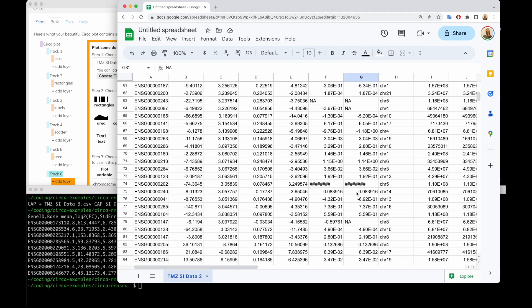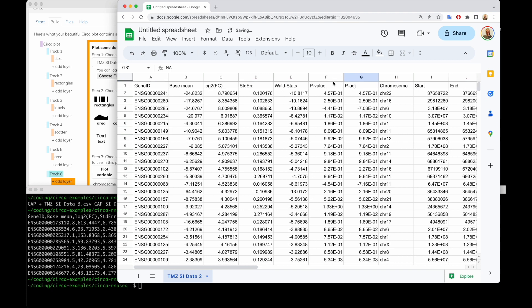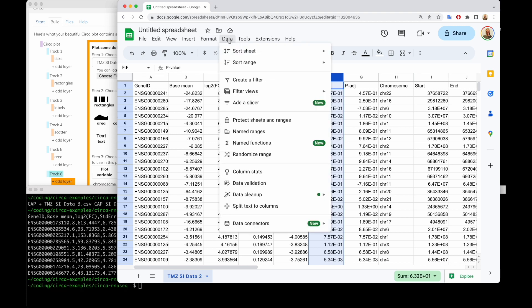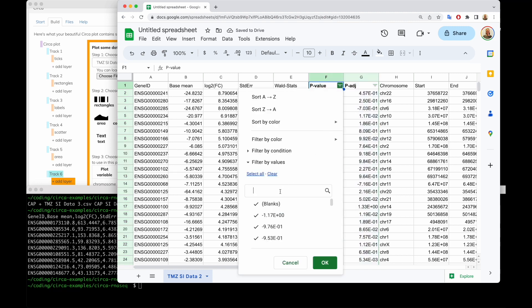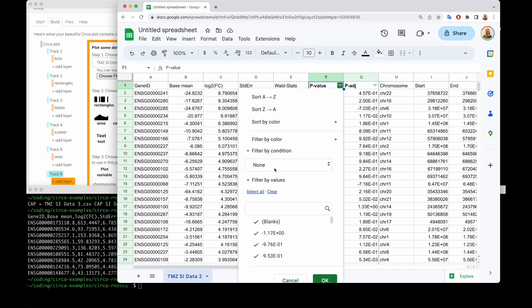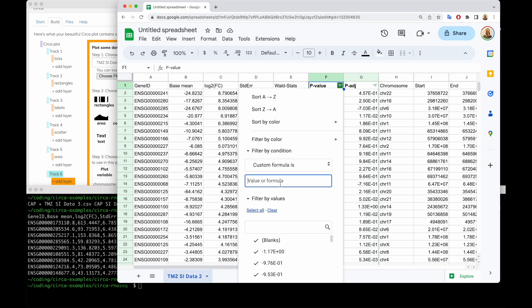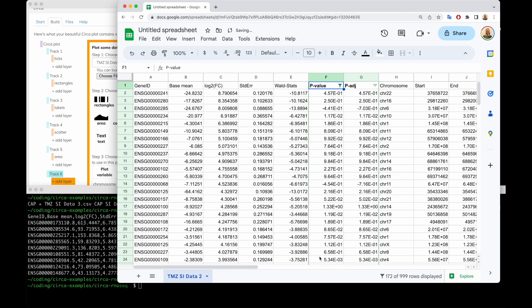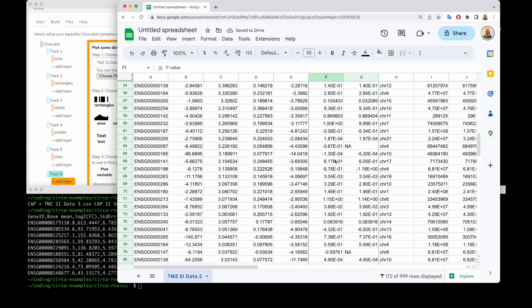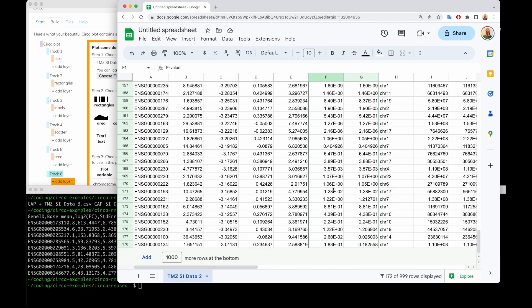Let's start by seeing if we can get rid of these NA values. It looks like we have two columns that are problematic. I'll set a filter — I'll go into Data and create a filter. I'm going to filter by condition using a custom formula: is a number. I'll say F2 because I'm in column F and want to start at row two. Now you can see all the NAs in this column have been removed.